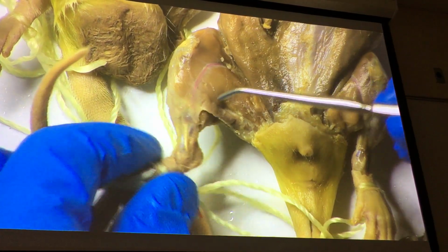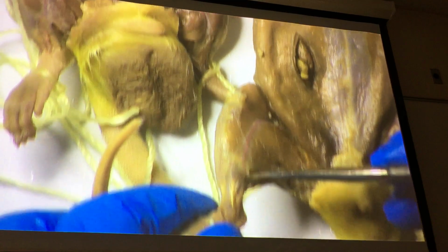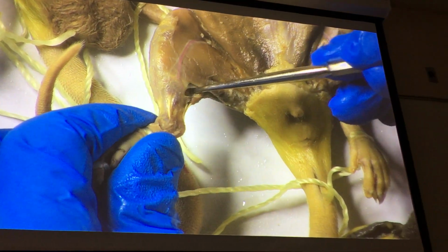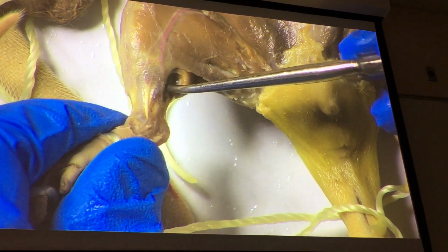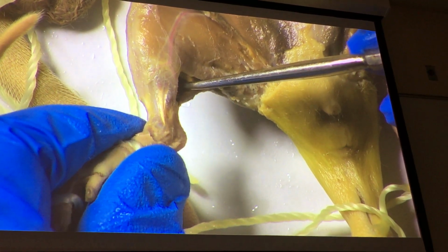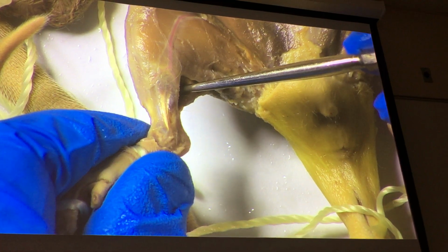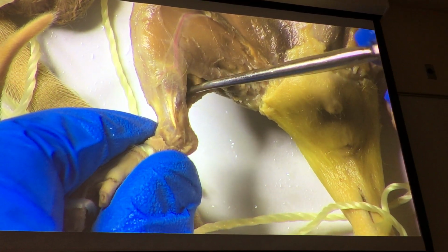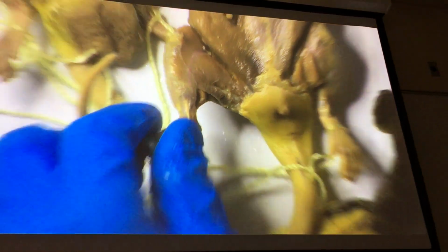On some of these animals under the gastrocnemius, you'll be able to see, if I fold this back, right underneath there, the soleus. Okay, the soleus works with the gastrocnemius. You can see this on your own legs, right? If you stand up on your tippy toes, like I have to do to reach the middle shelf, you'll see your gastrocnemius and soleus separate from each other. All right, so that takes care of, I think, all of this here.